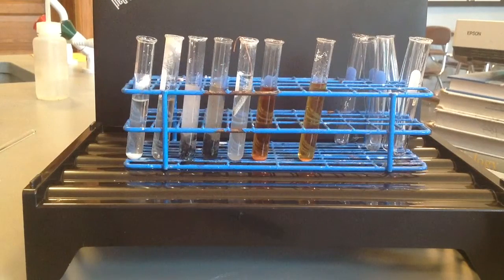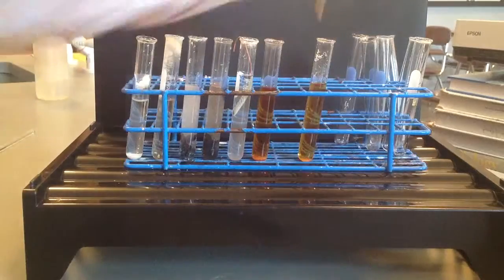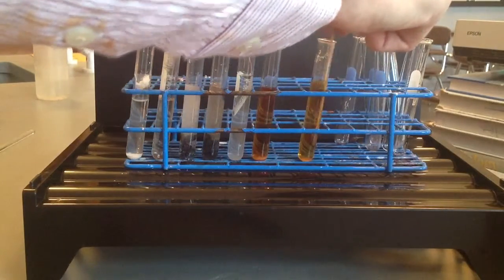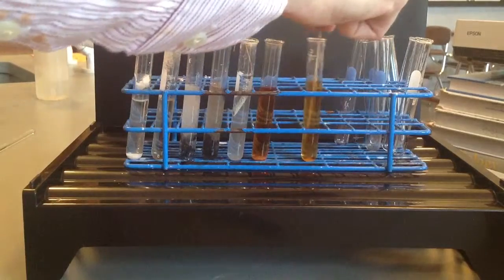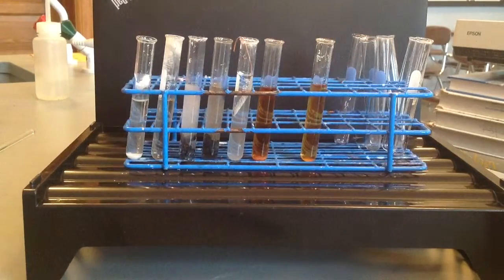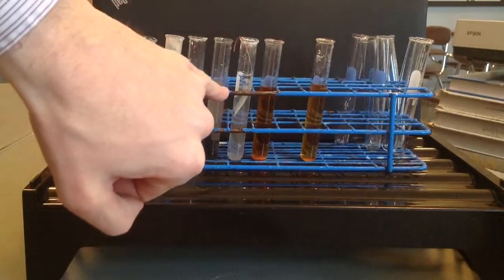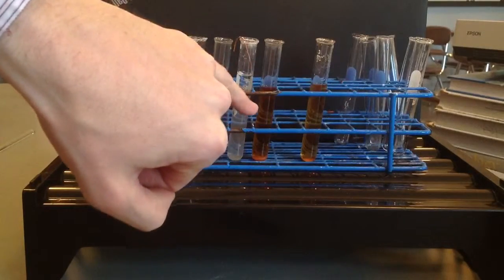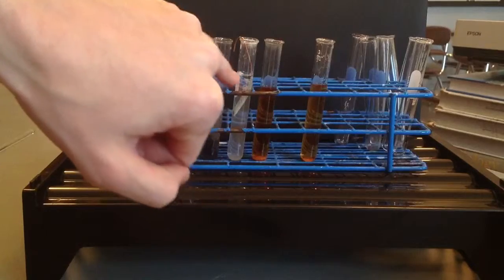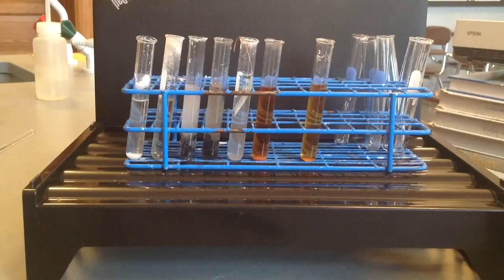There you go. I'm going to stir, although it probably doesn't really need it. You can see there was a pretty obvious change there, I hope. And also you can notice over here in our silver nitrate solution and copper wire, any sort of changes that are taking place. It's only been about 5 minutes, so we'll come back to it at the end after the 15.